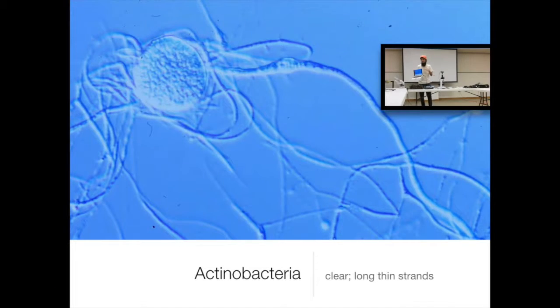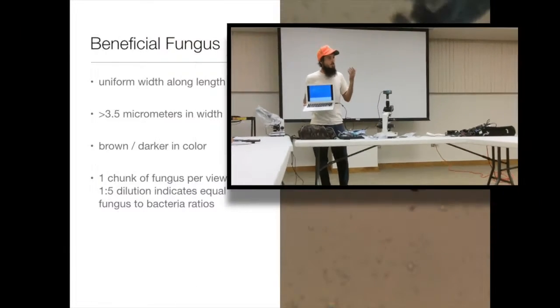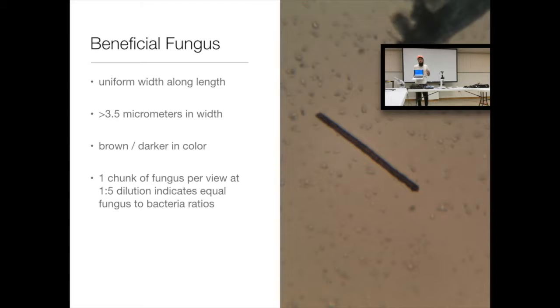Then the next level up from that is an actinobacteria, which this is where this form started to turn a little bit more elongated and into tubes. And if you see a lot of this in your sample, it's starting to go anaerobic. It's starting to run out of oxygen. This is also responsible for the smell when it rains. The smell that comes up is actinobacteria. There's tons of them everywhere. How does your soil run out of oxygen? Compaction.